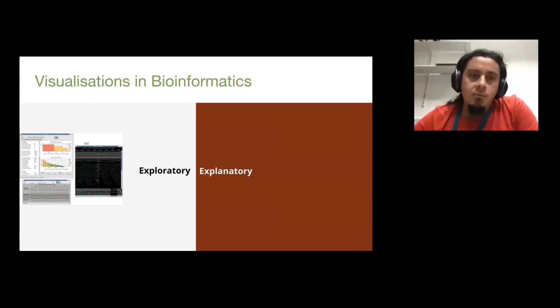Those are also very important, and I will try to go through them. Particularly in bioinformatics, we have seen visualizations on the exploratory side from the moment we get data, from the moment we get some sequence out of the sequencer and start analyzing it. We know that a sequencer is going to give us so much data that we cannot just read it manually, and we need to have some sort of view on it. For instance, we explore all the reads that give us the alignment.